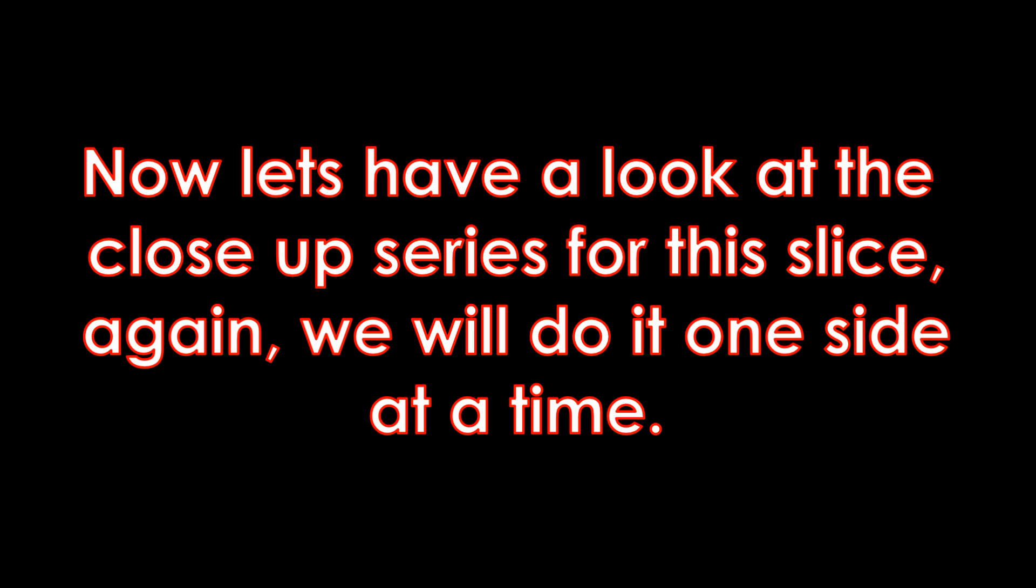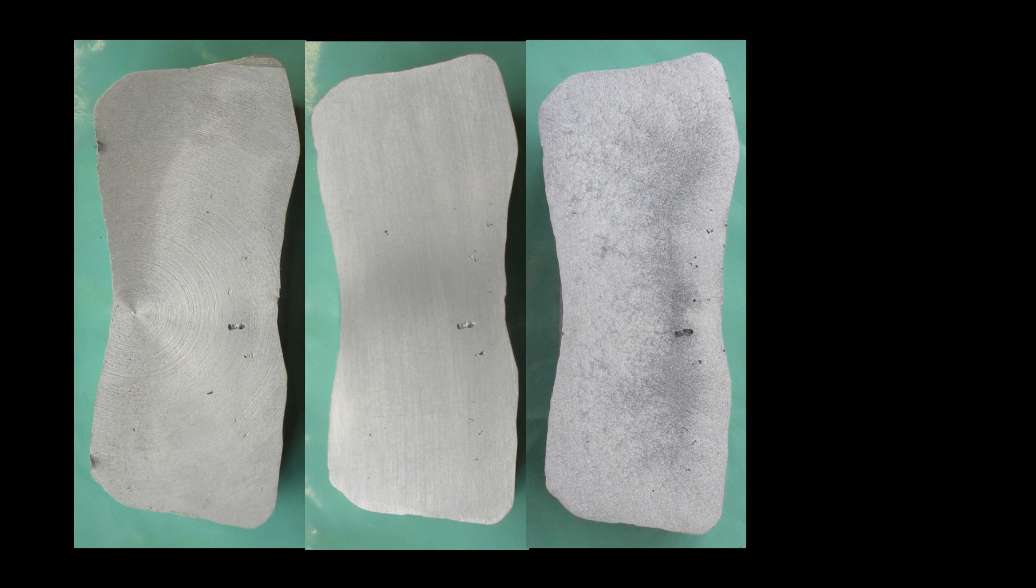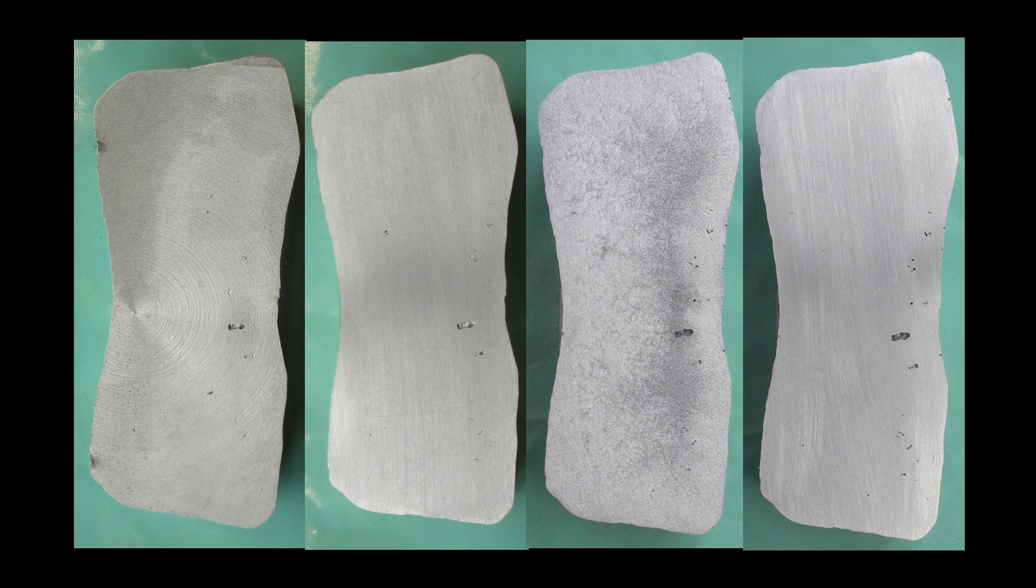Now let's have a look at the close-up series for this slice. Again we'll do it one side of the slice at a time. The first image we see here is of the machined surface. You can see some of the very coarse porosity but that's about all. Here we have the sanded surface and you can see a bit more of the porosity. Now the etched surface and again much more of the porosity shows but it's hidden by the colour of the etch. Now finally after a quick sand again we can see how much porosity there really is in that particular sample.